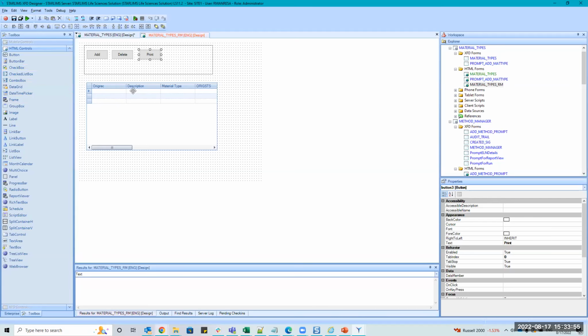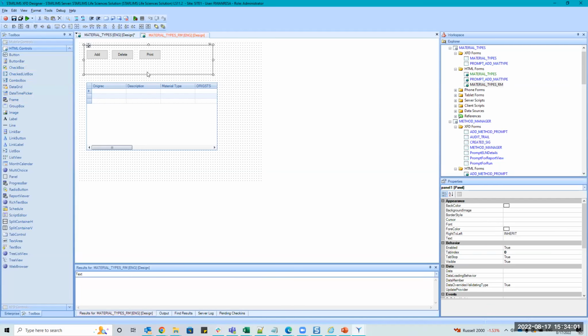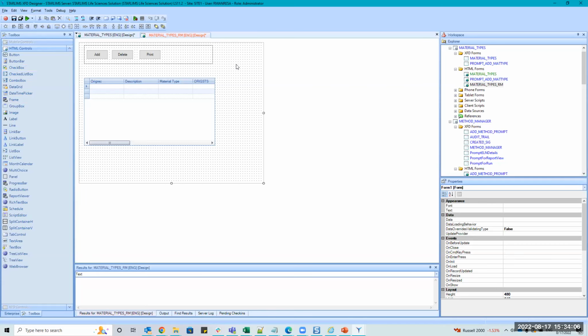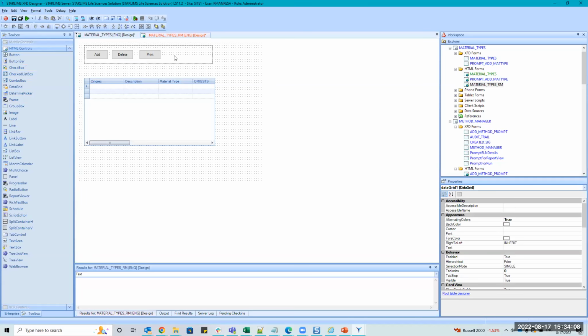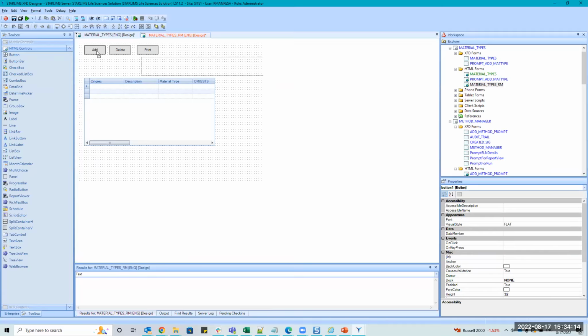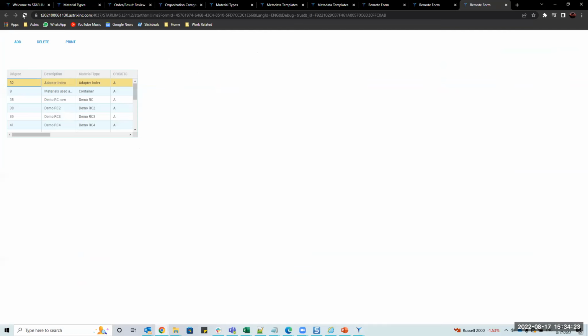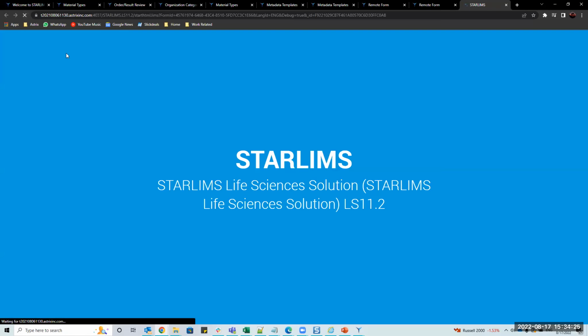The slides are going to get into it, but the basic idea is to start with the form and map out in the form how these controls need to look. For example, if you don't use a panel, it's not good either. So let me do this. This should be okay if I run it. It should still look good.